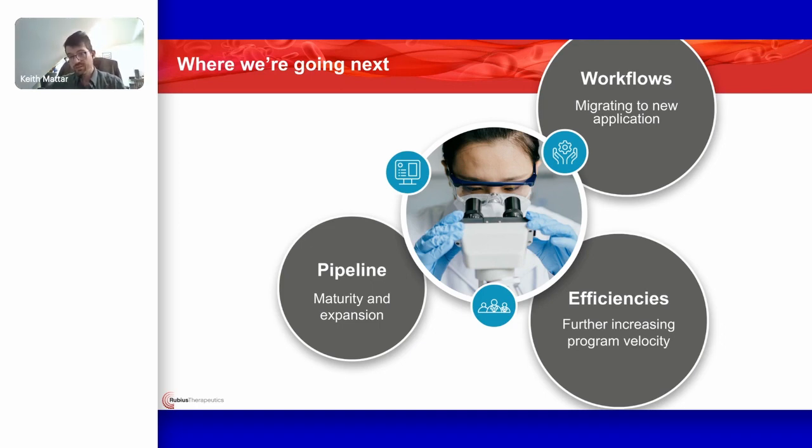And then lastly, we always plan to try and improve our efficiency. We plan to utilize additional trackable metrics enabled by the workflows application to further enhance our operational efficiency. We also want to build out more direct integrations between the instruments in the lab and Benchling. Using Benchling's lab automation platform, we still haven't really used it that much, so we really want to start using that.